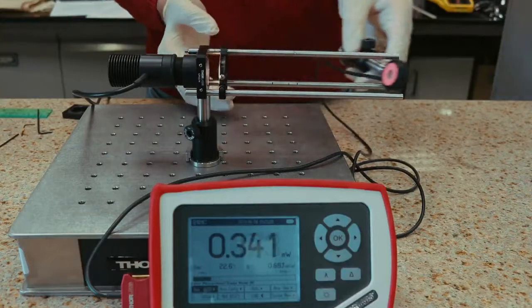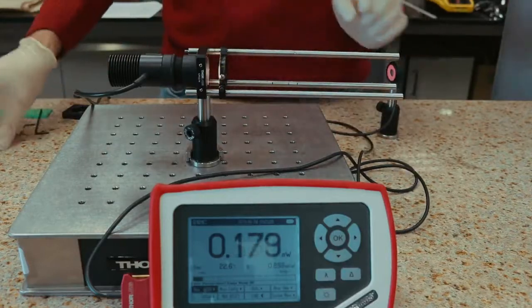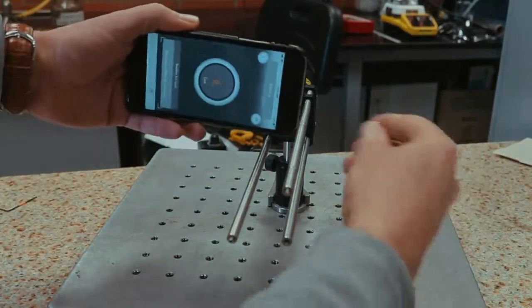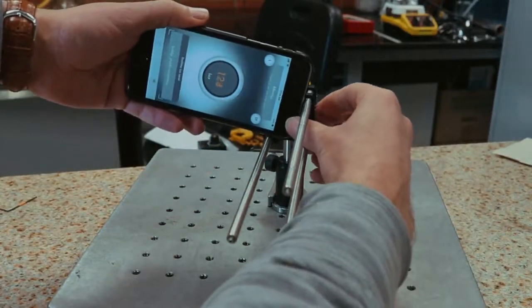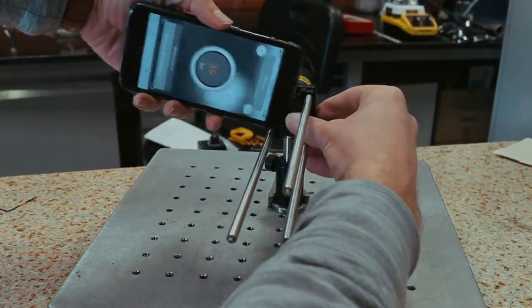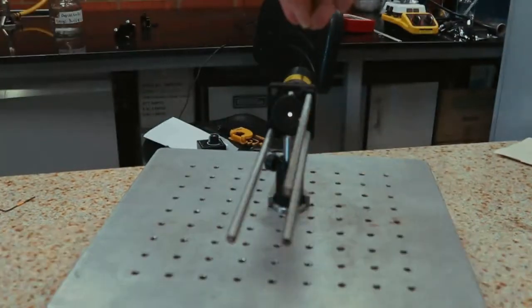Alternatively, you can use the instructions in step 7 to place a camera in front of the iris to measure the light intensity, or use a light meter app on your smartphone. Fix the iris in this position using the cage screws.